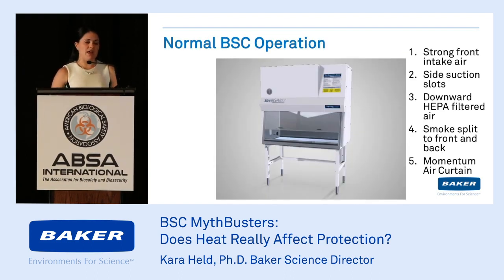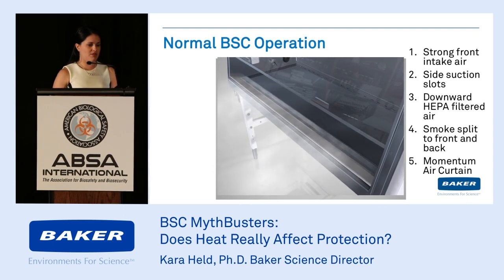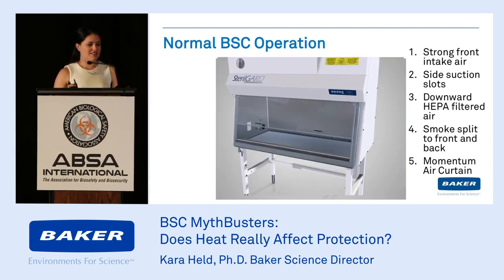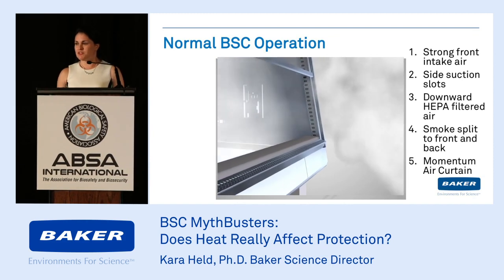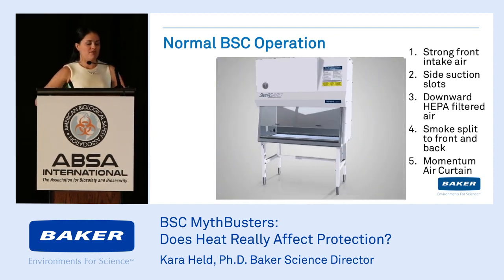So here's a little video about how a biosafety cabinet should be operating. You have a strong front intake air showing all the air coming straight in through the front, as well as through the side suction slots. Both of them provide a strong inward flow of air to protect the person, so no air can come out. Next you'll see the downward HEPA filtered air.